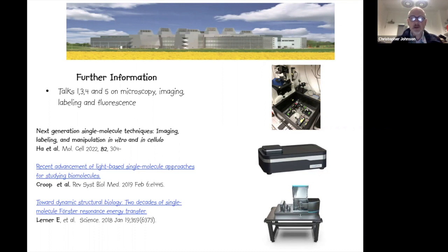The iSCAT technique is really interesting as it's very quick and uses low protein concentration. I'm surprised it's not more widely used. How do you compare SEC-MALS and iSCAT for molecular weight determination? What are the pros and cons comparing them? Okay, very good question.